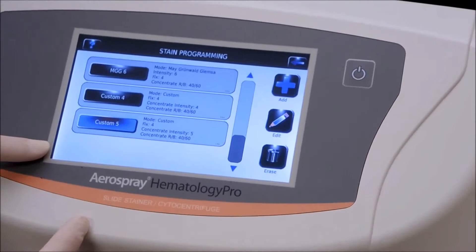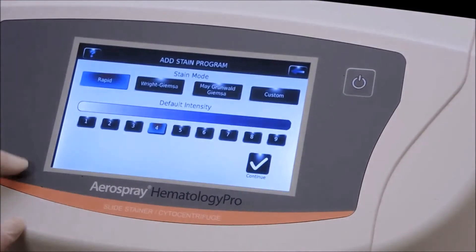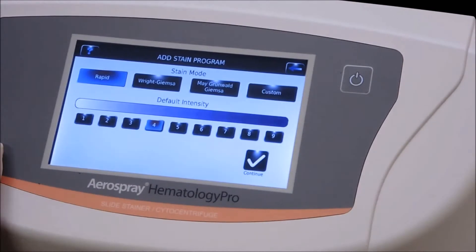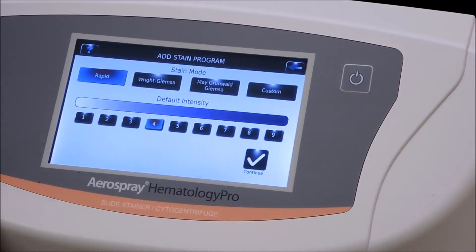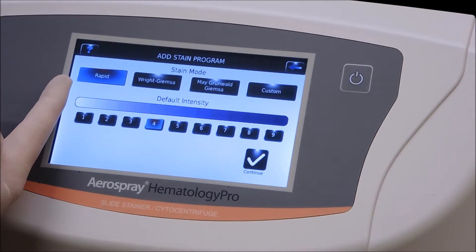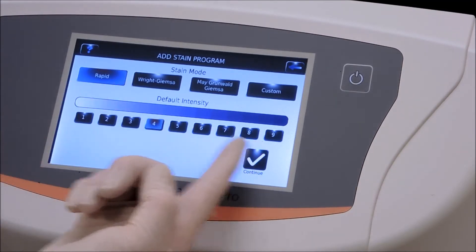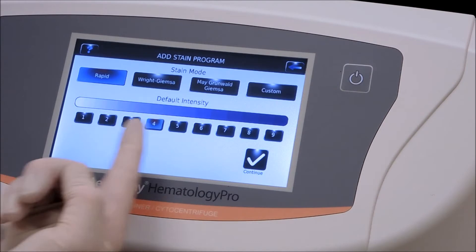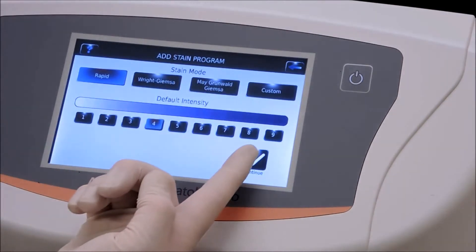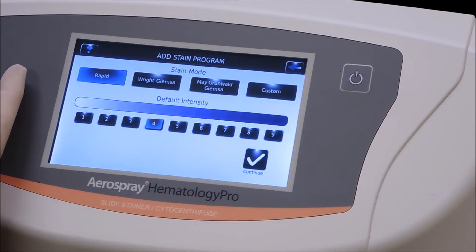Now we're going to add a program in where we deleted the custom number six program. Press the Add key. This will get you into all the programs we had previously — there are 36 programs total. You have nine rapid stain modes, nine Wright-Giemsa stain modes, nine May Grünwald Giemsa stain modes, and nine custom stain modes.